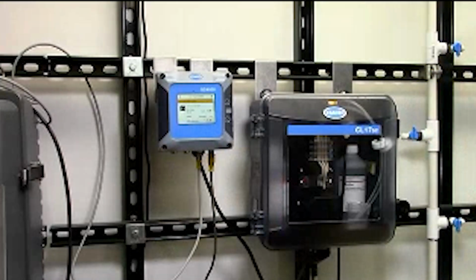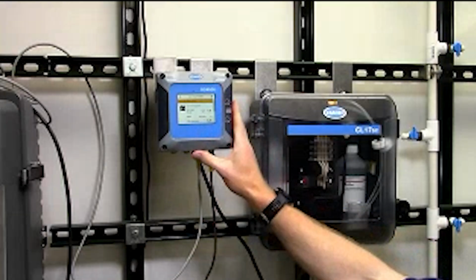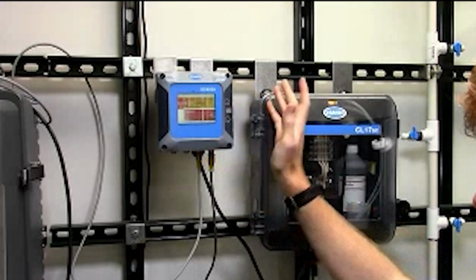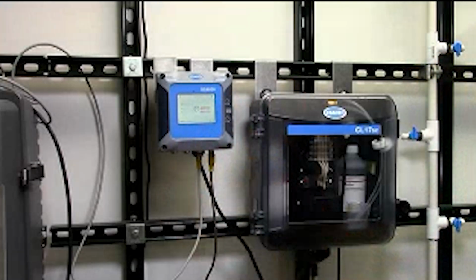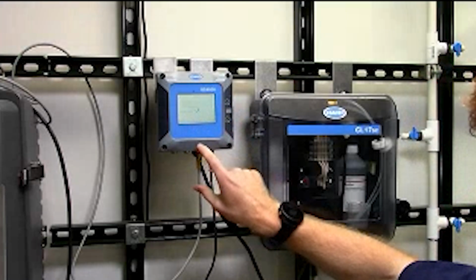And in order to do this, I hope you can see my SC4500 controller all right here. But again, if you haven't seen an SC4500 yet, this is what it looks like. Not too dissimilar from your phone or something. We have color and touch screens now. But I'm going to just press on the CL17, come all the way down to my device menu, and I'm going to go through the standard tasks of replacing tubing.